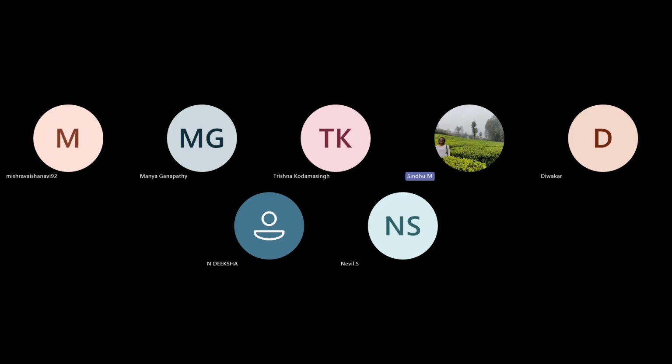Anyways, I'm just using these values roughly here. They may or may not be correct because these are some sample images about which we don't know much. And this voxel depth is the Z imaging interval. So suppose you take Z stacks every 1 micron, then this value has to be 1. But here it does not apply because we don't have any Z slices. And let's say that these were imaged every 1 minute.